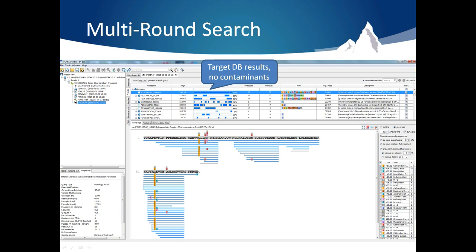Another good benefit of Multi-Round Search is limiting your search space. By filtering out identified spectra, you can limit your search space in order to identify difficult targets. For example, you can identify endogenous peptides in a digested sample. First, run a search using the enzyme you used to digest the sample, then run a Multi-Round Search with no enzyme to find endogenous peptides.